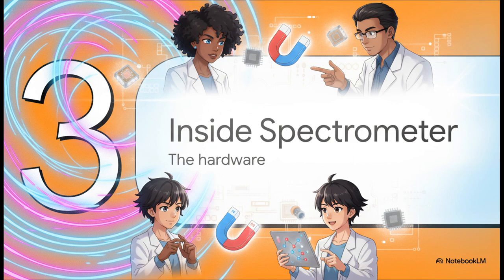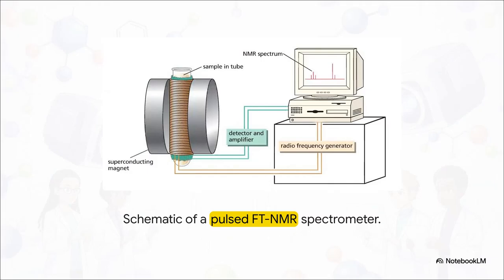Okay, let's jump into Section 3, inside the spectrometer. We've got this physical signal from our microscopic magnets, but now we need the hardcore hardware that actually captures it. At the absolute heart of a pulsed Fourier transform NMR spectrometer, the little sample tube sits directly inside a constant superconducting magnet. And wrapped right around that sample is a super specialized coil. Now, this coil does double duty. It fires off that initial radio frequency pulse we talked about, and then it immediately acts as a pickup coil to listen for that oscillating electrical FID signal as the nuclei relax.